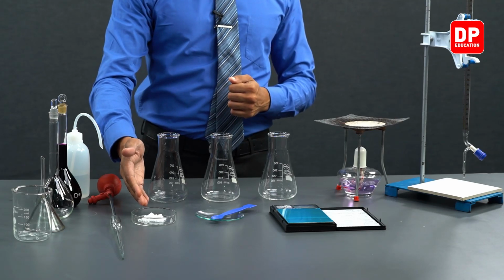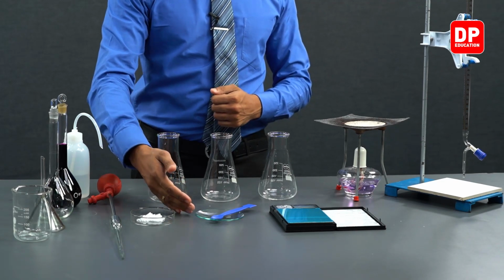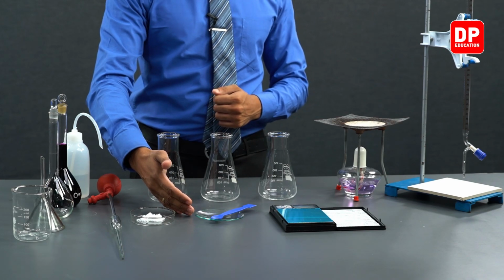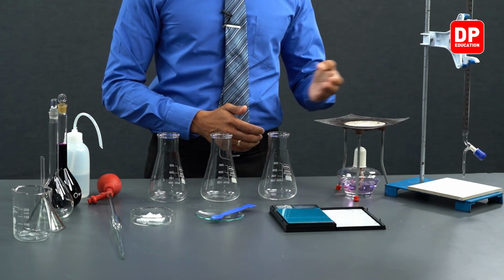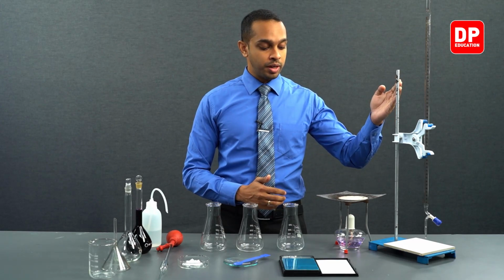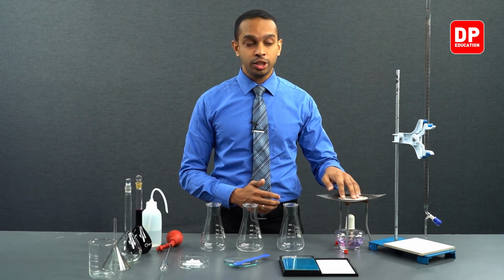We will be using potassium oxalate, the white powder you see here. We will be using a watch glass to measure the potassium oxalate, a spatula, 3 titration flasks, a retort stand that you see over here. We will be using a spirit burner with a tripod and a wire mesh.